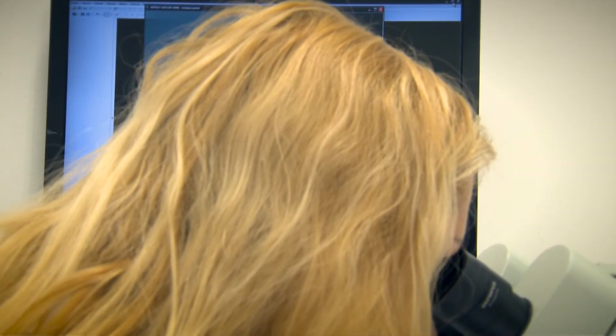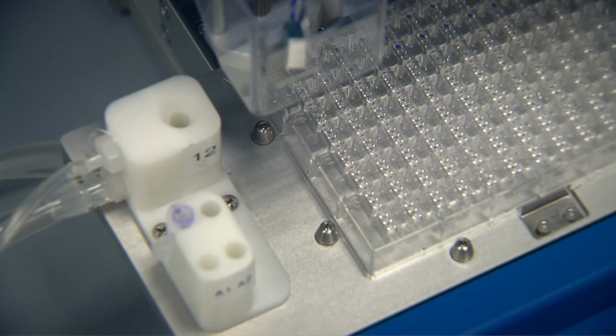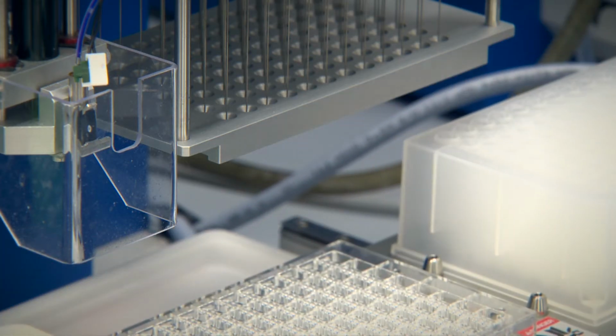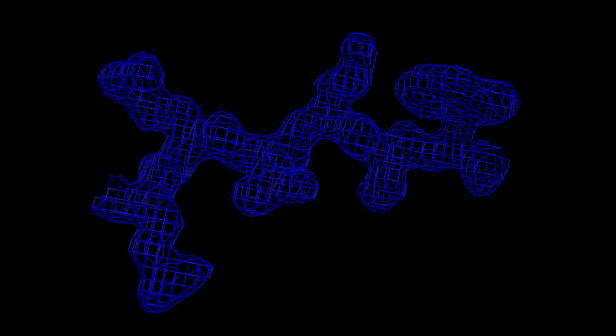Although people carry out the majority of the work, specialized robots can perform some activities such as liquid preparation into crystallization plates or monitoring of progress of crystallization in the crystallization hotel. We obtain information about the molecular architecture from crystals using scattering of shortwave radiation, so-called diffraction, and by consequent mathematical evaluation of measured data.